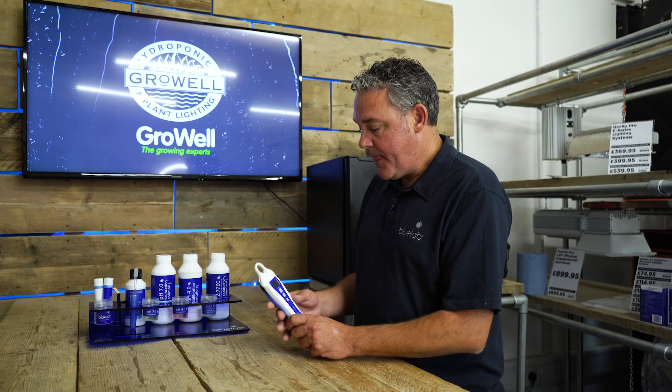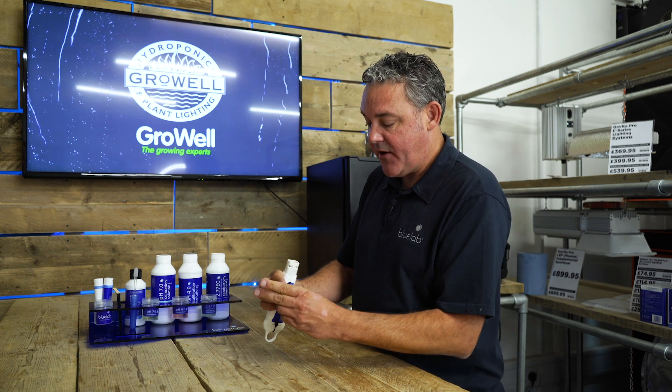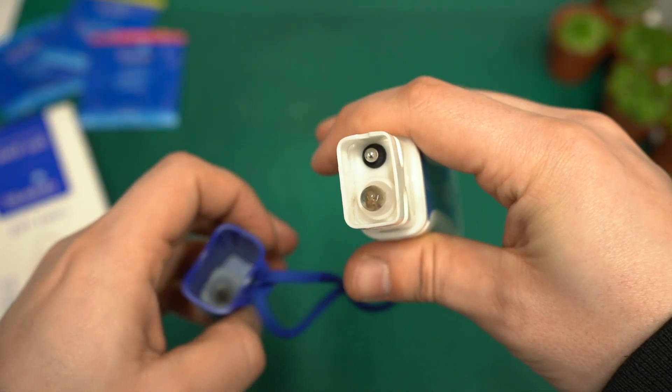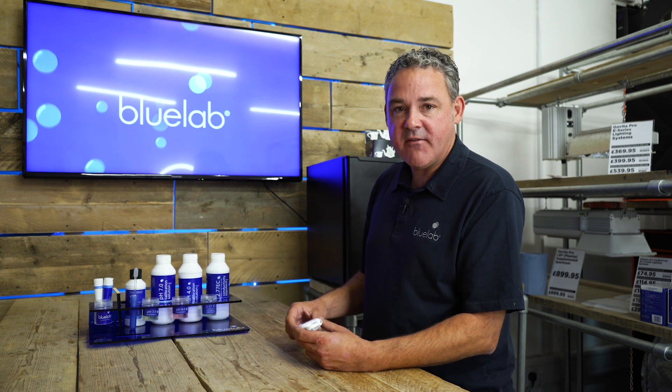This is the Bluelab pH Pen. It's very durable, well built, and accurate to 0.1. This glass bulb here is what measures the pH; it also measures temperature as well. It's 100% waterproof, which means you can add it into your tank and let it float there as you're adding in the acid.